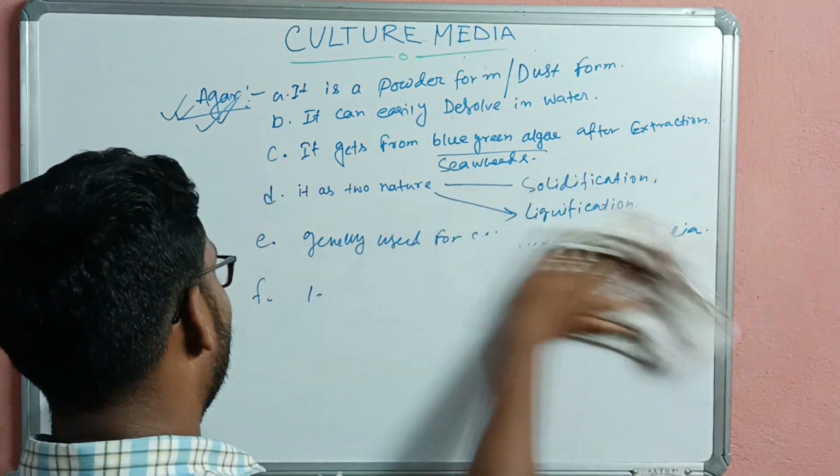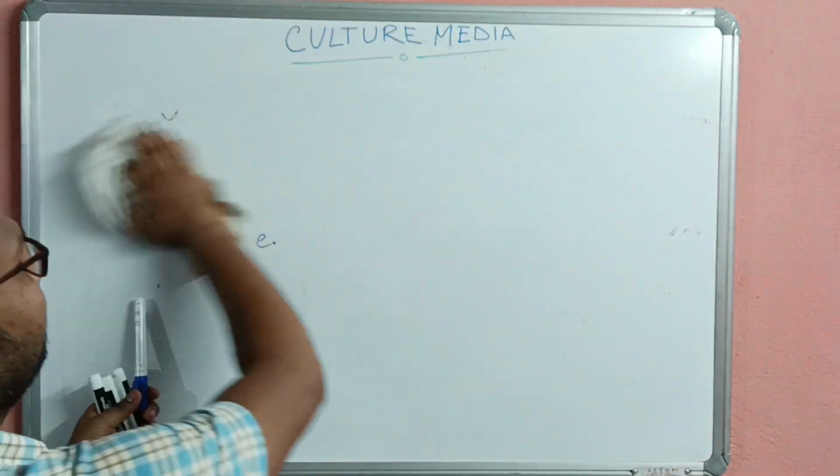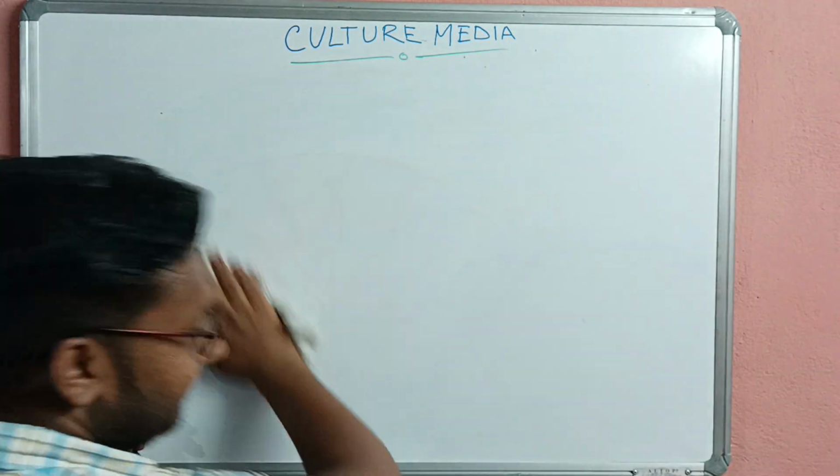Now we come to the different types of media and their classification.